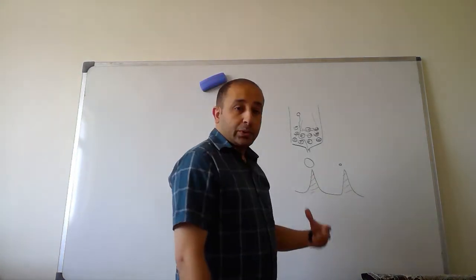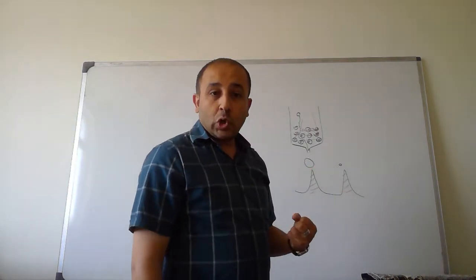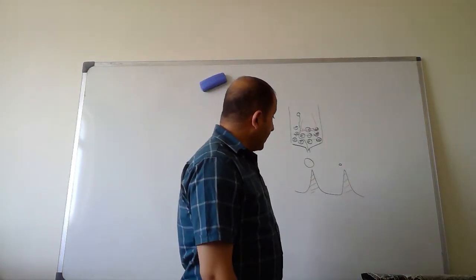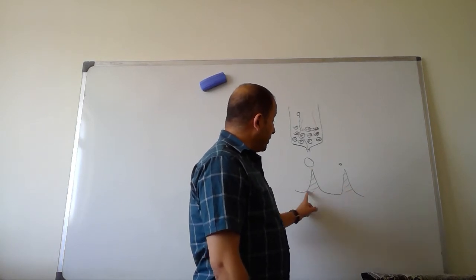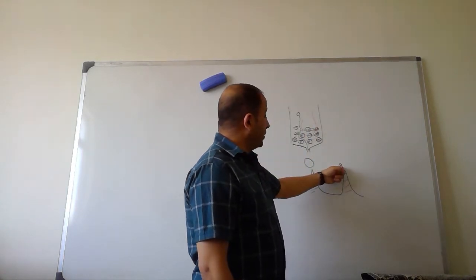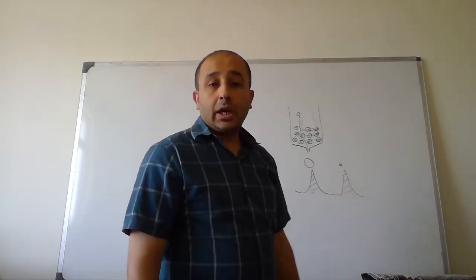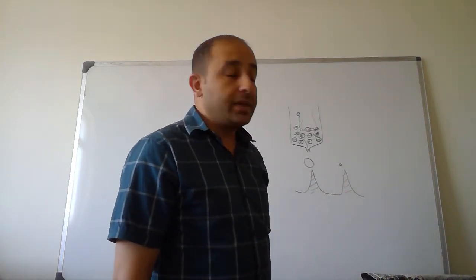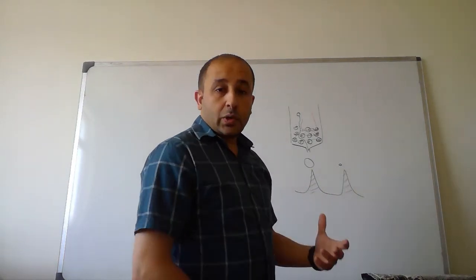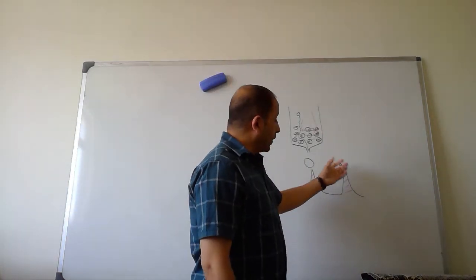If it contains a good chromophore, then the molecule will absorb light better than those which lack a chromophore. The other thing is that the area under the curve relies on the quantity of the material. So if we have an abundant quantity of small molecules, the area under the curve will be larger than for big molecules, or vice versa, relying on two factors: the chromophoric part, the absorptivity of the molecule, and the quantity of the molecule.